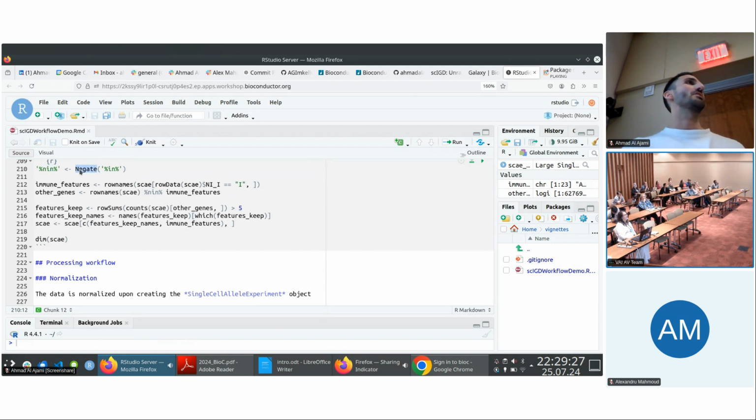I don't know. Does anybody use it like that? No. It's really cool. Gotta do the exclamation point. No, this is really cool. So you just negate on that.